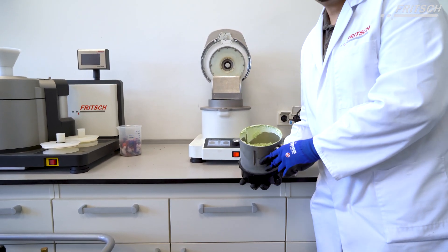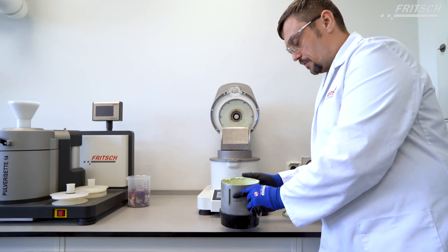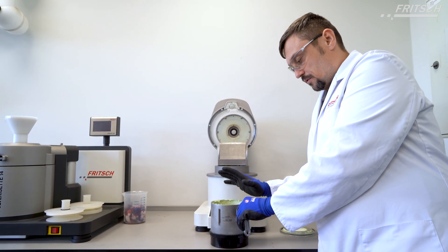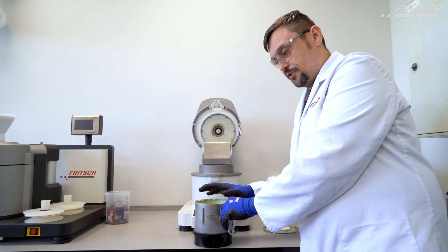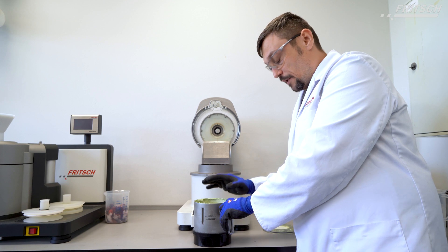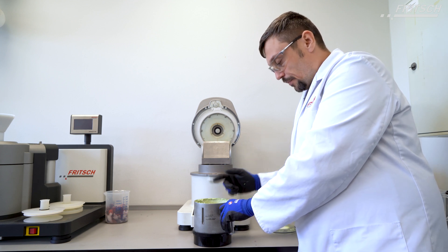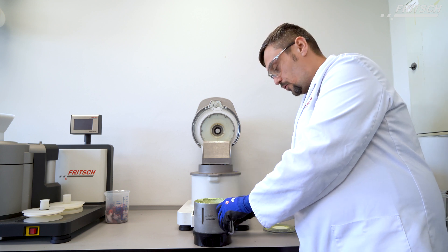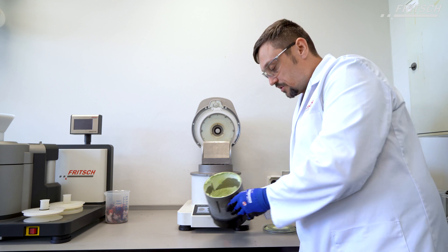The quantity of liquid nitrogen is very important for a successful trial. Do not overdose the liquid nitrogen — let it all evaporate. Also, the quantity of sample is very important for the homogeneity of the grinding result.